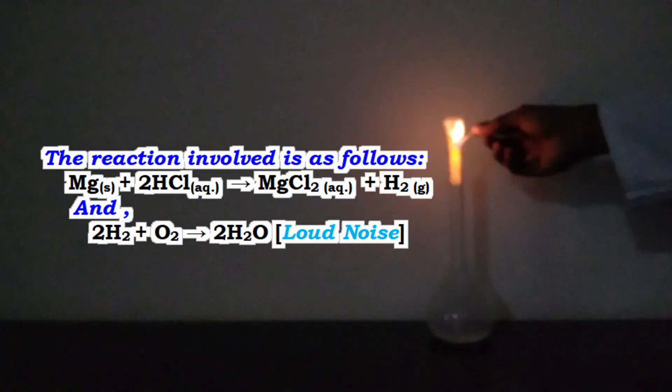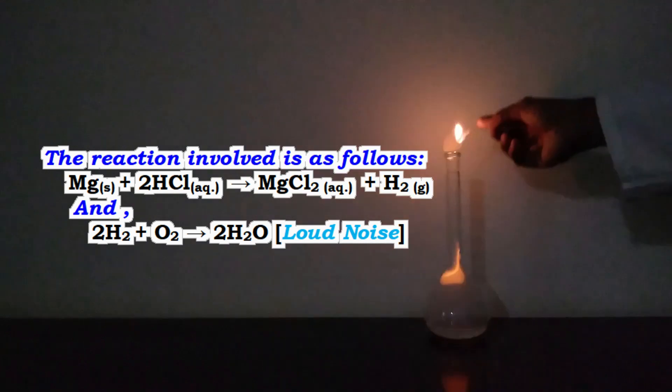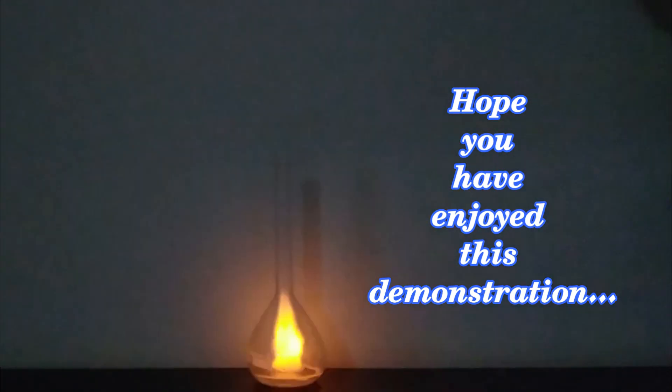The reactions involved are as follows: Mg + 2HCl → MgCl₂ + H₂, and 2H₂ + O₂ → 2H₂O. Hope you are enjoying this demonstration.